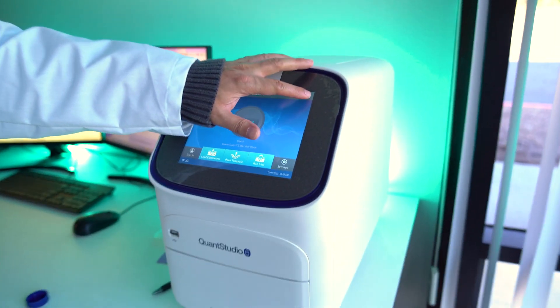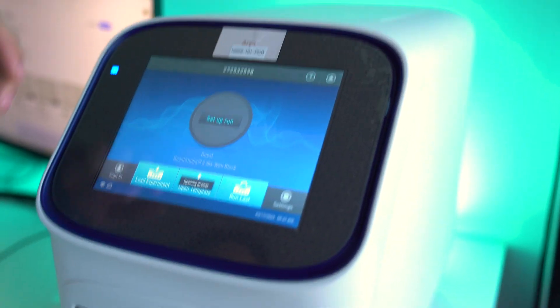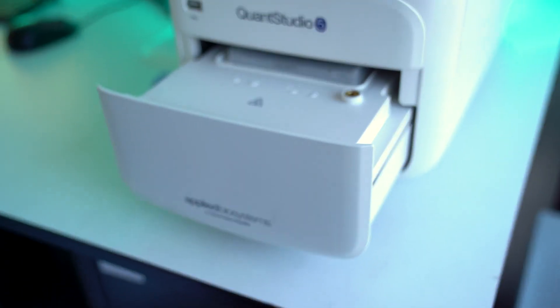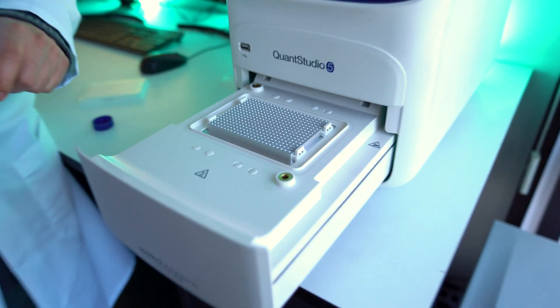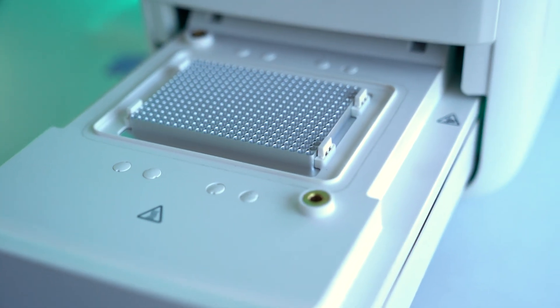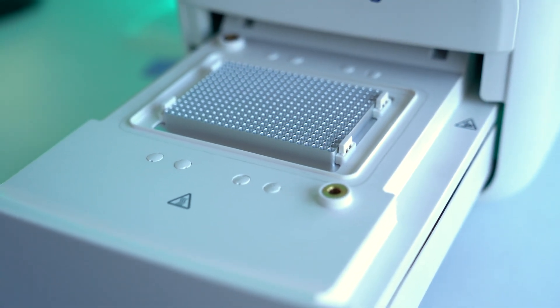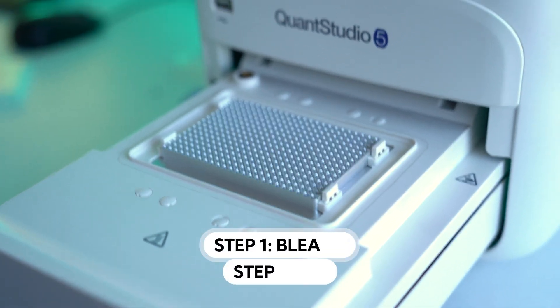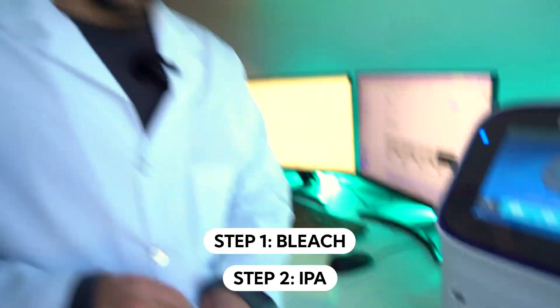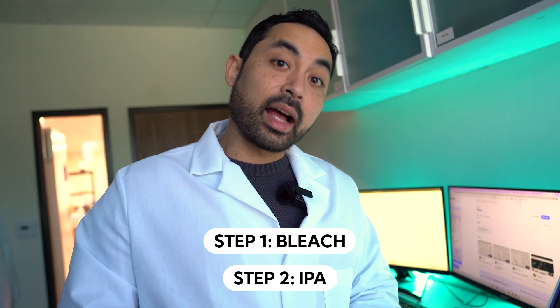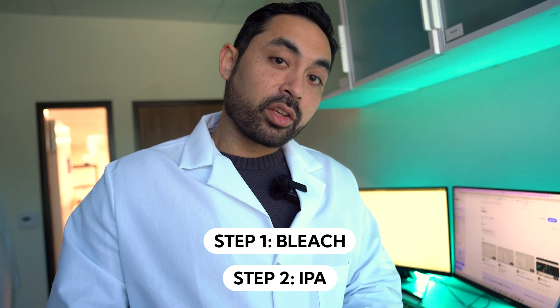I'm going to show you how to clean a PCR well. So let's open up the system. What you're going to see here is you have a metal block. The way that you clean the metal block is with 5% bleach and IPA.